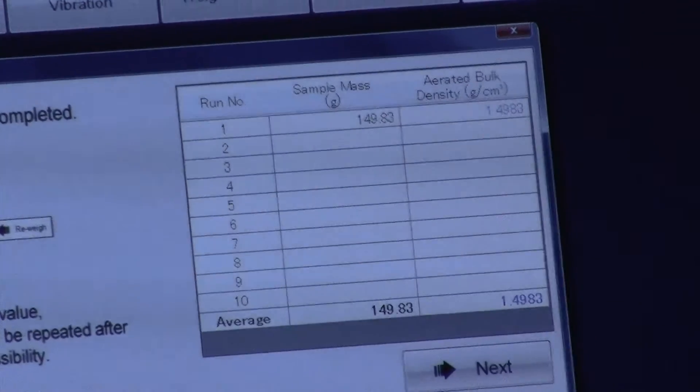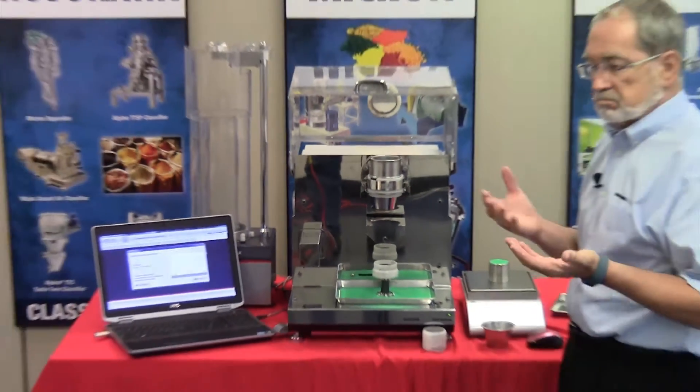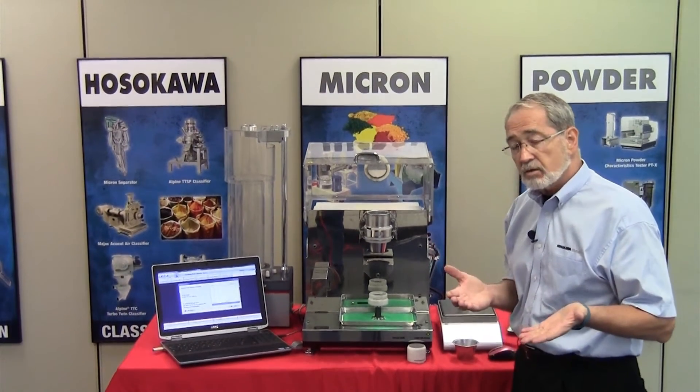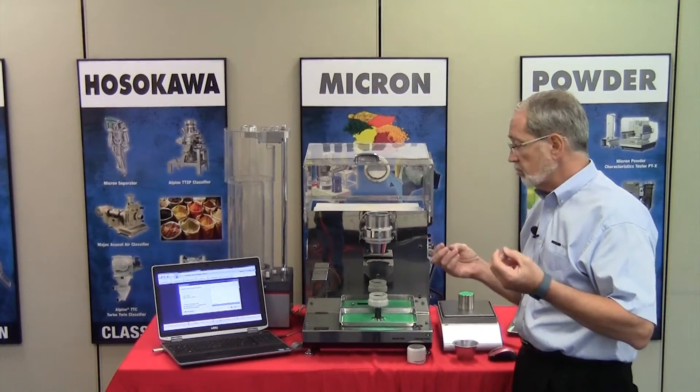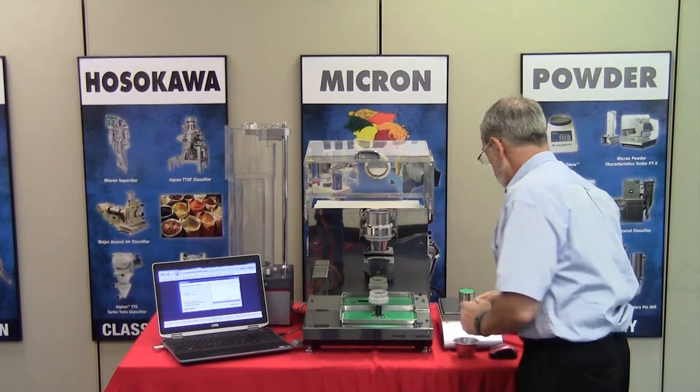The aerated density can be repeated if necessary, however in many cases you can just proceed.